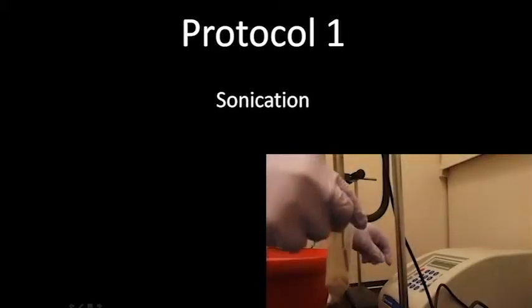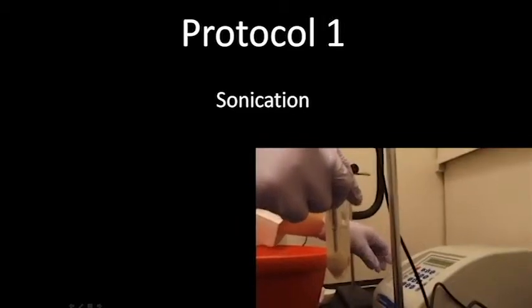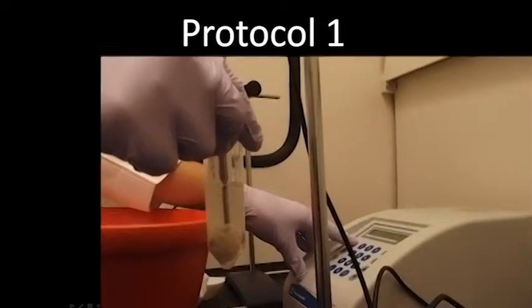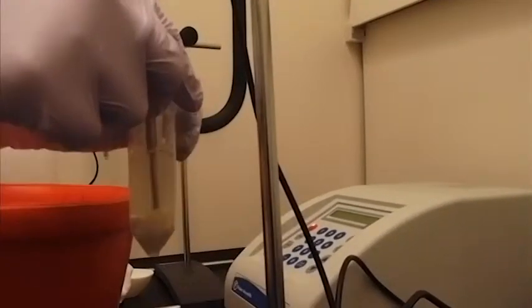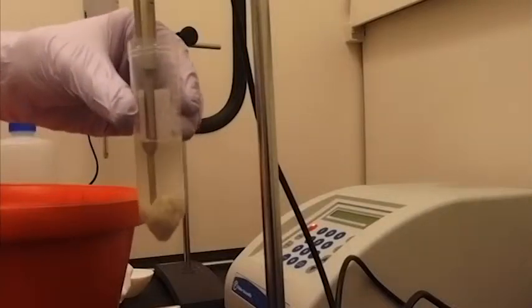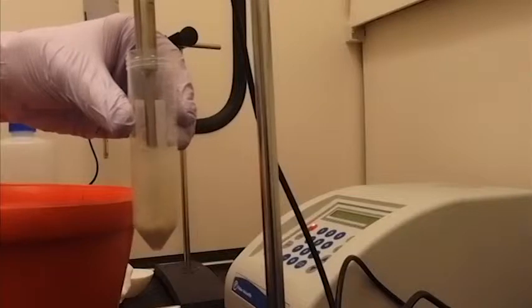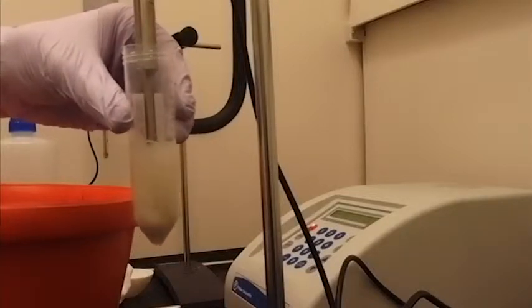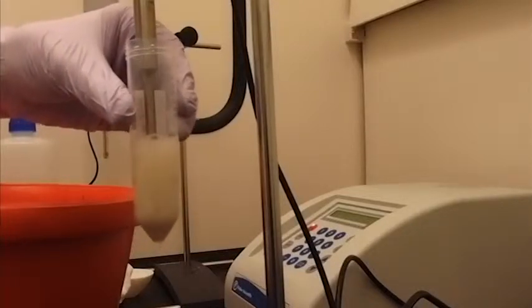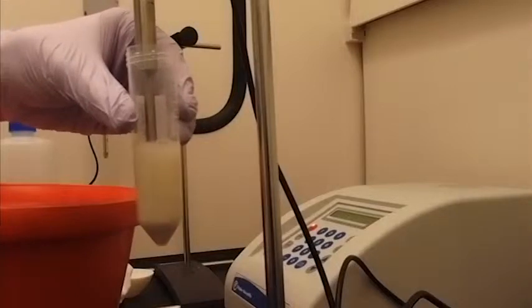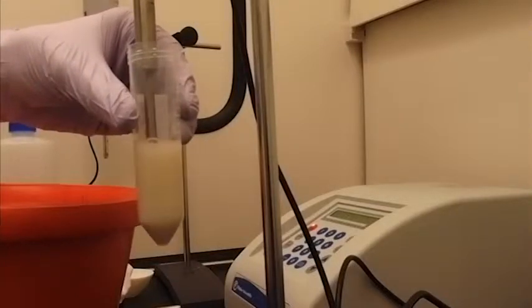The first protocol for PIA extraction is through sonication. The cells are suspended in water and the sonicator tip produces high frequency vibrations. The local force from the vibrations strip the PIA from the surface of the cells. You can't see the sonicator tip moving, but you can hear the sound it produces from the vibration. As the sample becomes more homogeneous, the PIA is being dissolved into the water.